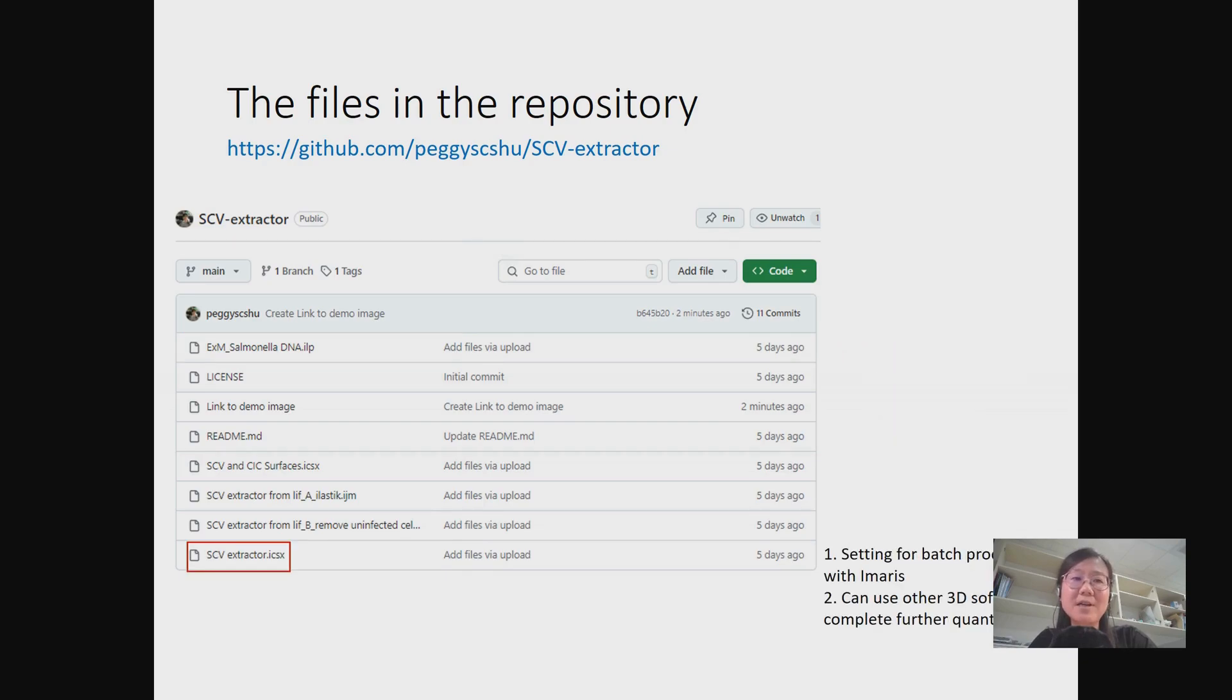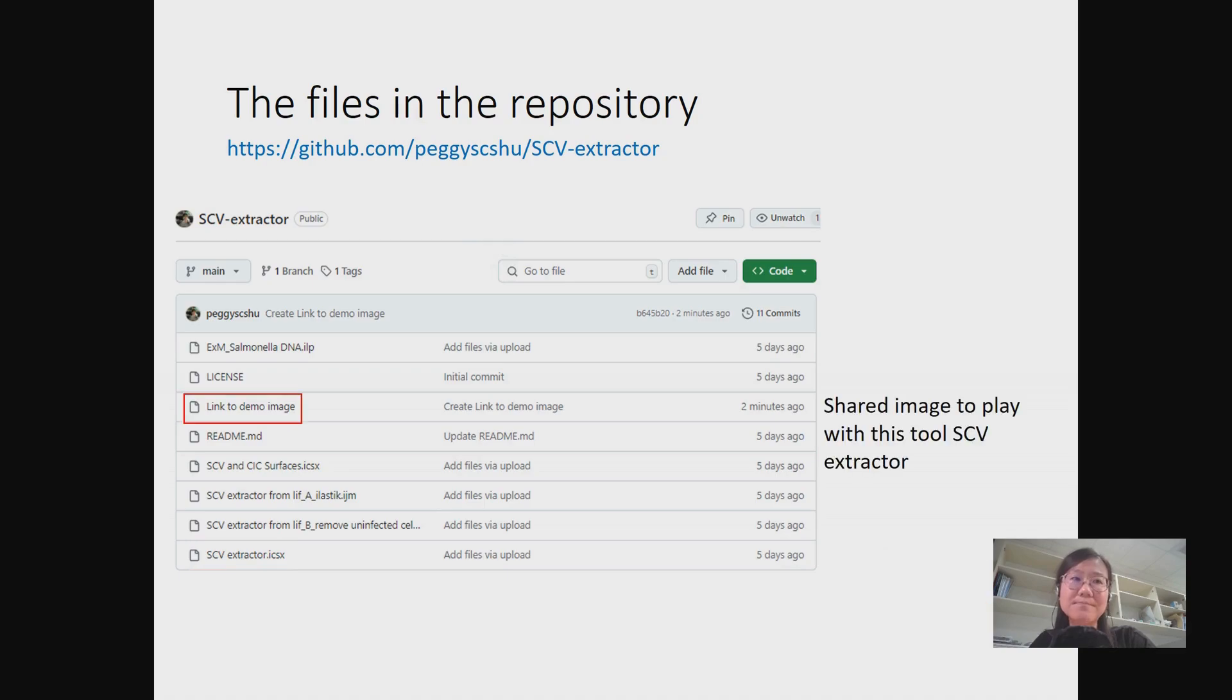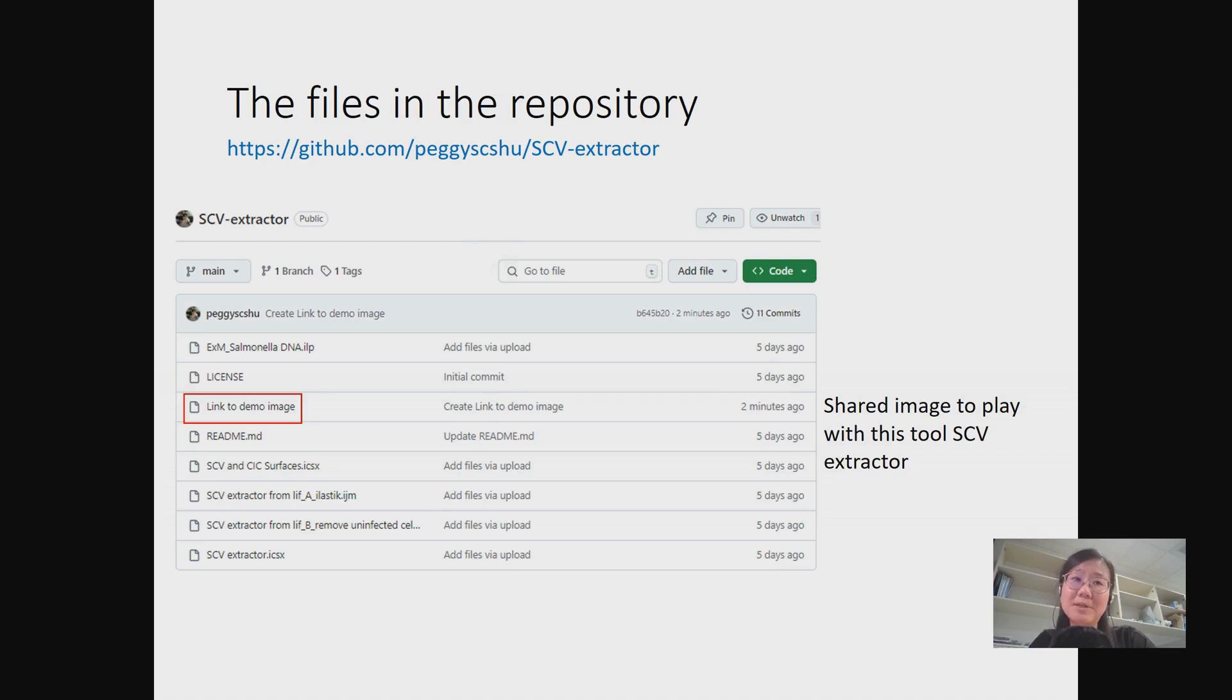After extraction, you can generate 3D modeling or quantify images with any software. Here I offered a setting for the batch process with Imaris. To make it easier, I shared two images for you to play with this tool. Please download the demo images from the offered link.